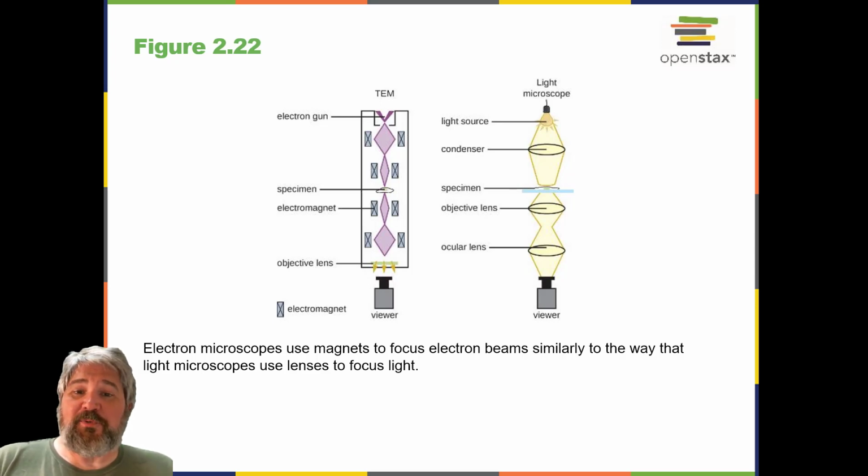For electrons to pass through the specimen in a TEM, the specimen must be extremely thin, 20 to 100 nanometers thick. The image is produced because of the varying opacities in various parts of the specimen. This opacity can be enhanced by staining the specimen with materials such as heavy metals, which are electron dense. TEM requires that the beam and specimen be in a vacuum and that the specimen be very thin and dehydrated. The specific steps needed to prepare a specimen for observation under an EM are discussed in detail in the next section.